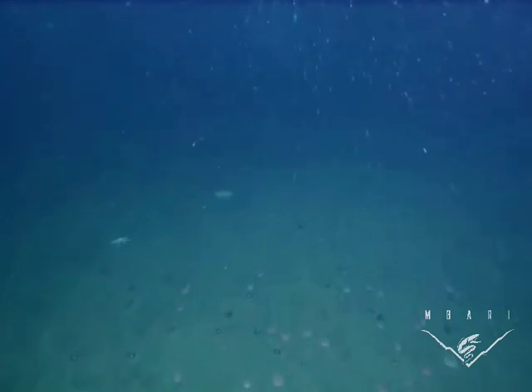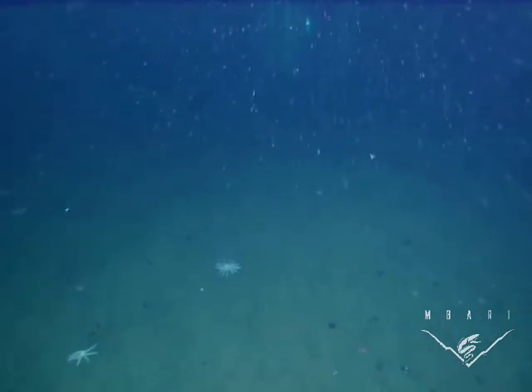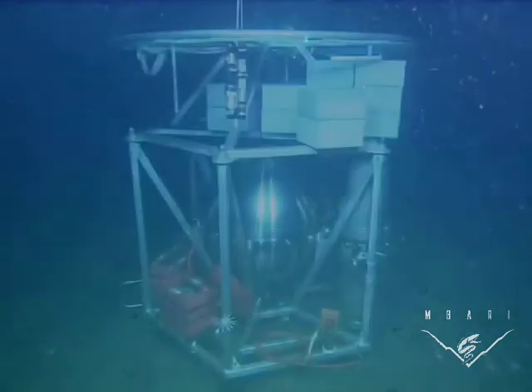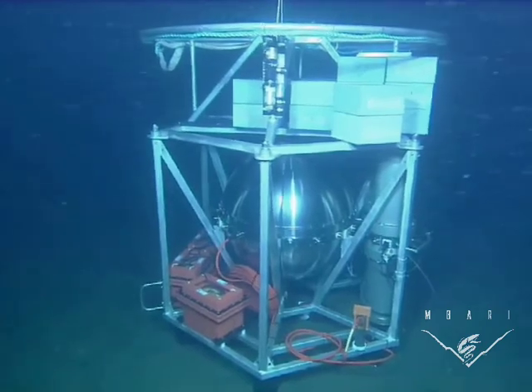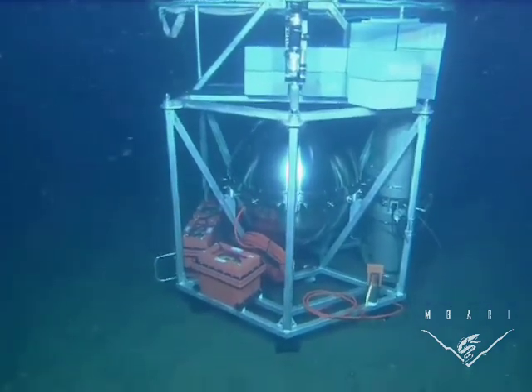The ESP is a microbiology laboratory in a can — or in a sphere in this case. It samples the water and, using various molecular techniques, it looks for either larvae, or phytoplankton, or bacteria, even viruses that are present in the water.